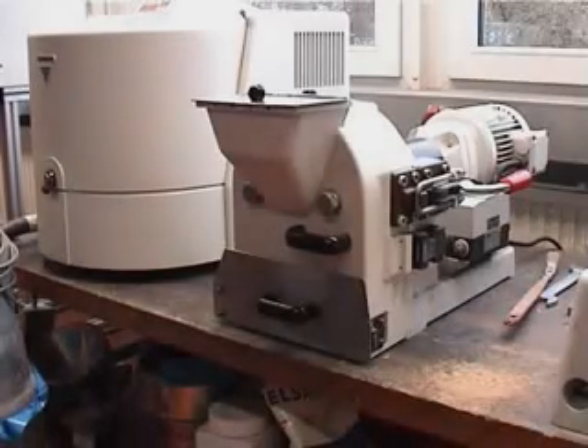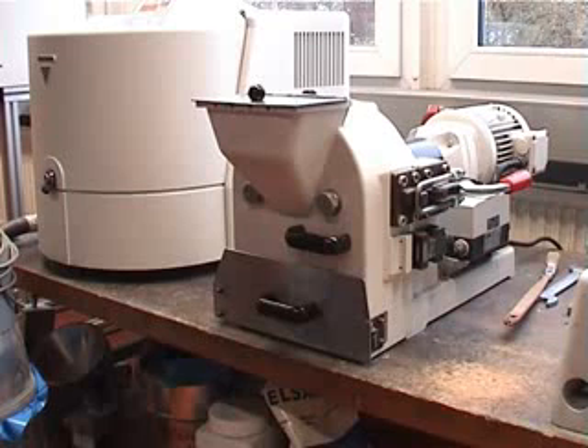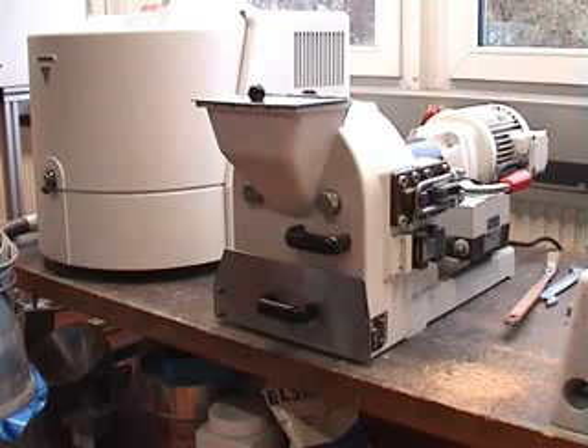Hello. In the following minutes I want to explain the operation of our disc mill Pulverisette 13. The principle of the disc mill is milling and grinding by friction between two discs inside of the mill.